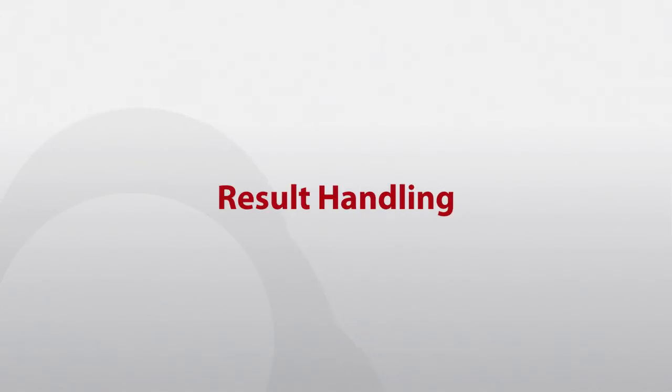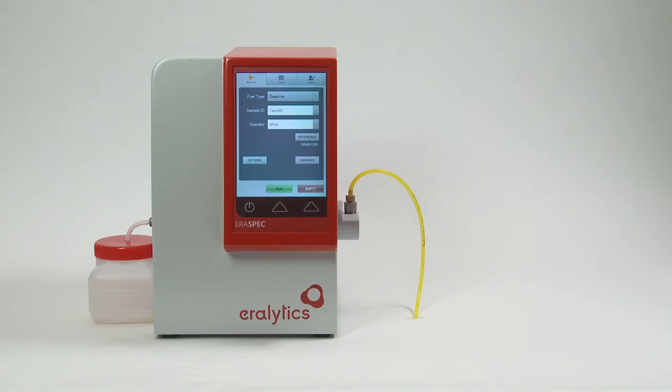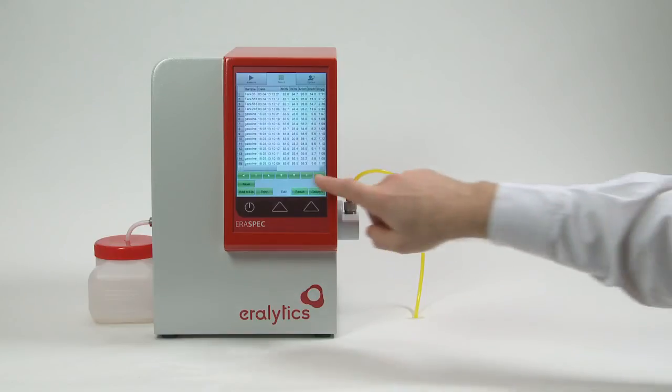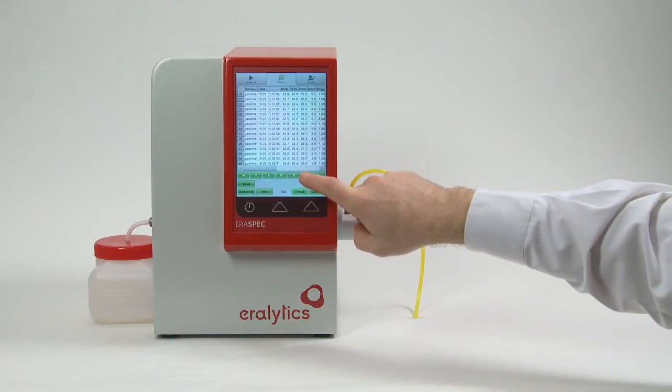Result handling. In the result menu, several thousand results can be stored and reviewed. Simply go to the result menu. Each line displays a result.